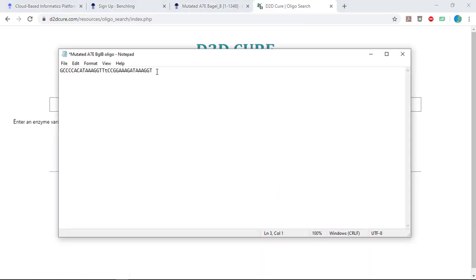If it's the same, that means the codon you selected is already the preferred codon for that amino acid. If it's different, that means that there's another codon that the organism preferentially uses to encode that amino acid, and your mutant codon has been changed to reflect that. Consult the genetic code table to verify that the new codon still encodes the mutated amino acid you selected. You can copy and paste this optimized sequence to a new text file, naming it as the optimized oligo sequence. Now you're done. The final step is to save your oligo sequence to the class Google Sheet linked on Canvas.